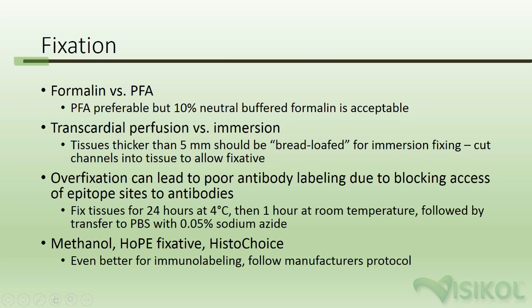Fixation. Paraformaldehyde is preferable for fixation, but 10% neutral buffered formalin is acceptable. Transcardial perfusion is recommended for all tissues thicker than 5 millimeters. Tissues thicker than 5 millimeters where perfusion is not available should be bread loafed for immersion fixing, wherein you cut channels into the tissue to allow the fixative to penetrate to the center.